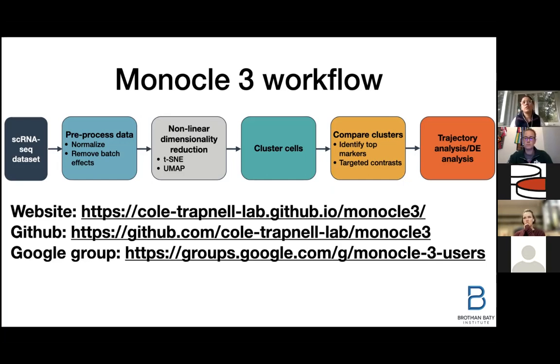two more things that you can do, the two more major things, are differential expression analysis or trajectory analysis, which would come in the later tutorials. Because each one is a very big part, so it requires the whole 2 hours. So I foresee having the next one for differential expression analysis and the one after that for trajectory analysis. And I have included links to the Monocle 3 website, the GitHub page, and the Google group in case you have questions or you want to open issues.